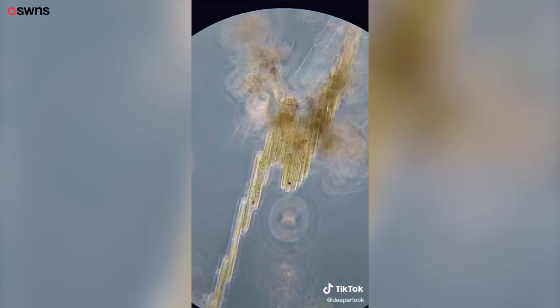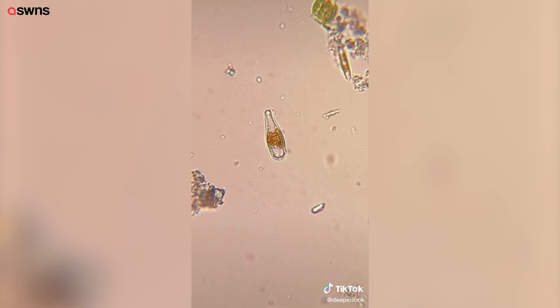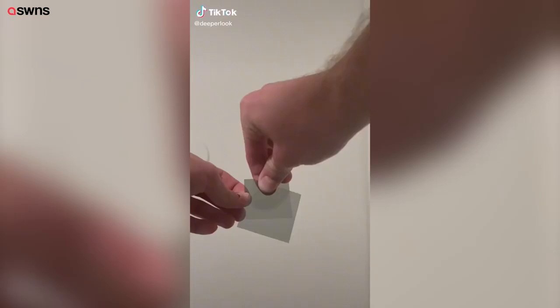If you don't know about diatoms, here's the rundown: they're phytoplankton that are encased in glass. They produce 20–50% of the earth's oxygen. And I think this one looks like a Coke bottle.